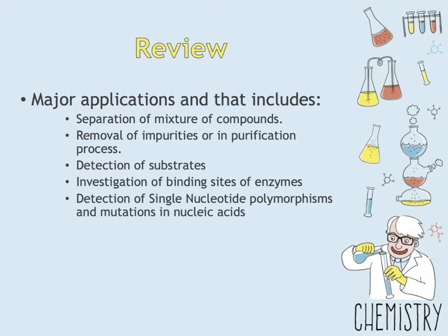There are also major applications that are observed in affinity chromatography. One of them includes the separation of mixture of compounds, removal of impurities or purification process, detection of substrates, investigation of binding sites of enzymes, detection of single nucleotide polymorphisms and mutations in nucleic acids, and many other major applications that fit the very definition of affinity chromatography.